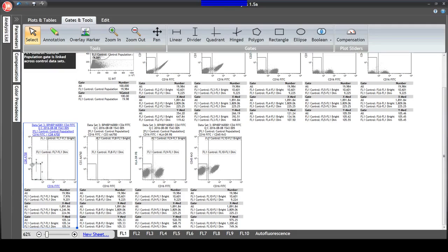All right, so for really bright fluorochromes, negative can be really negative. For really dim fluorochromes, negative can be fairly bright. It's just part of using all of these different fluorochromes together and making them play nicely.